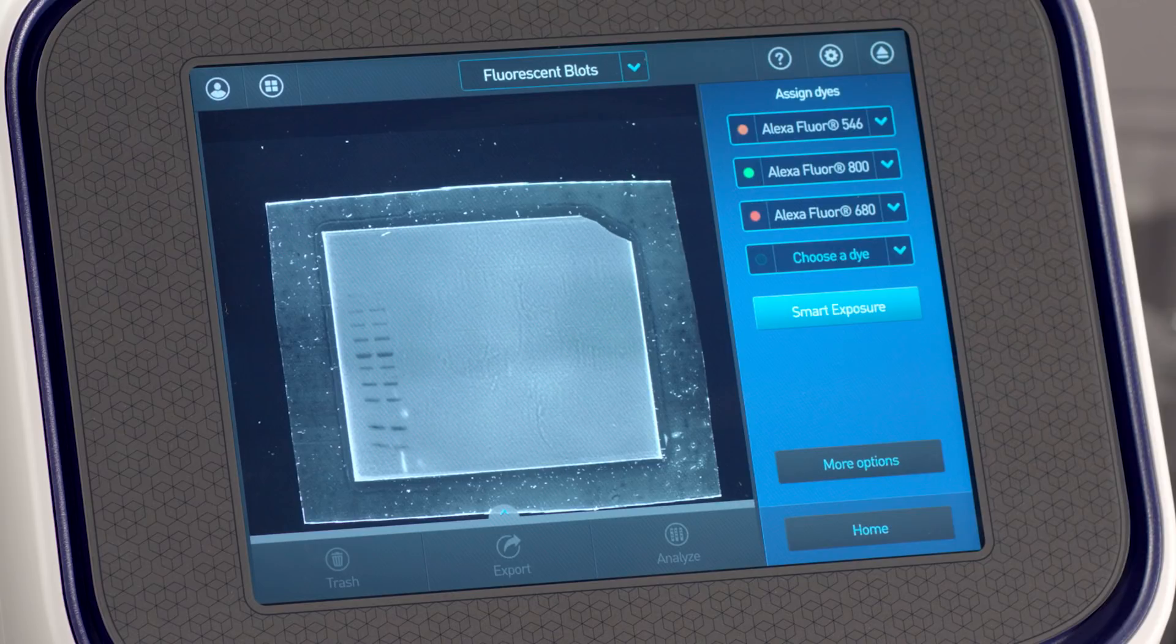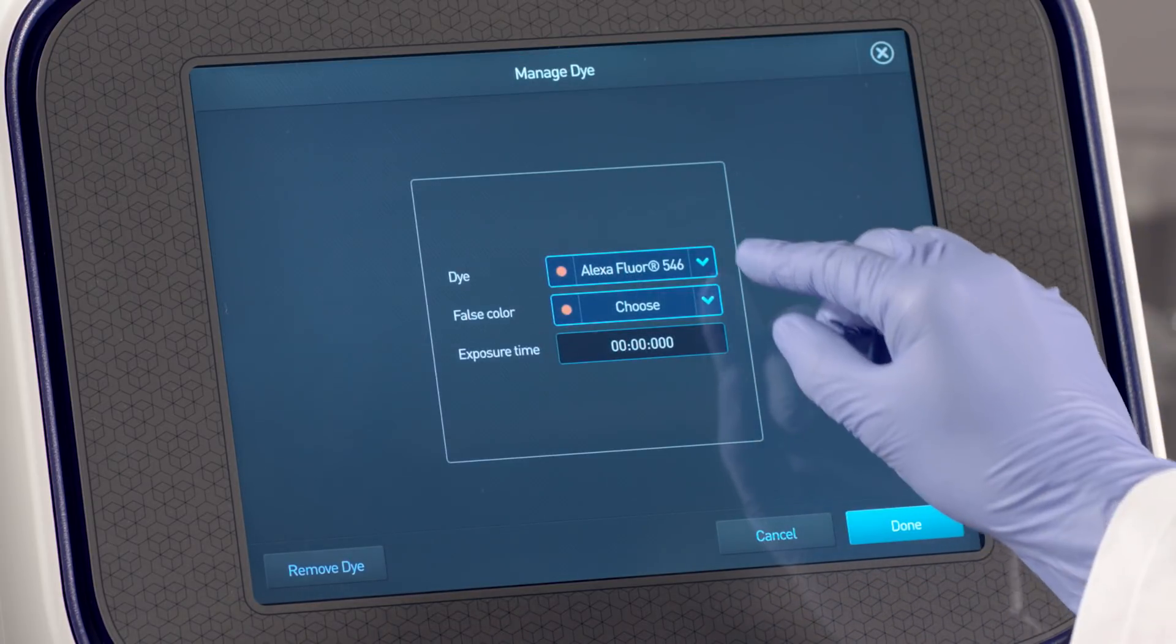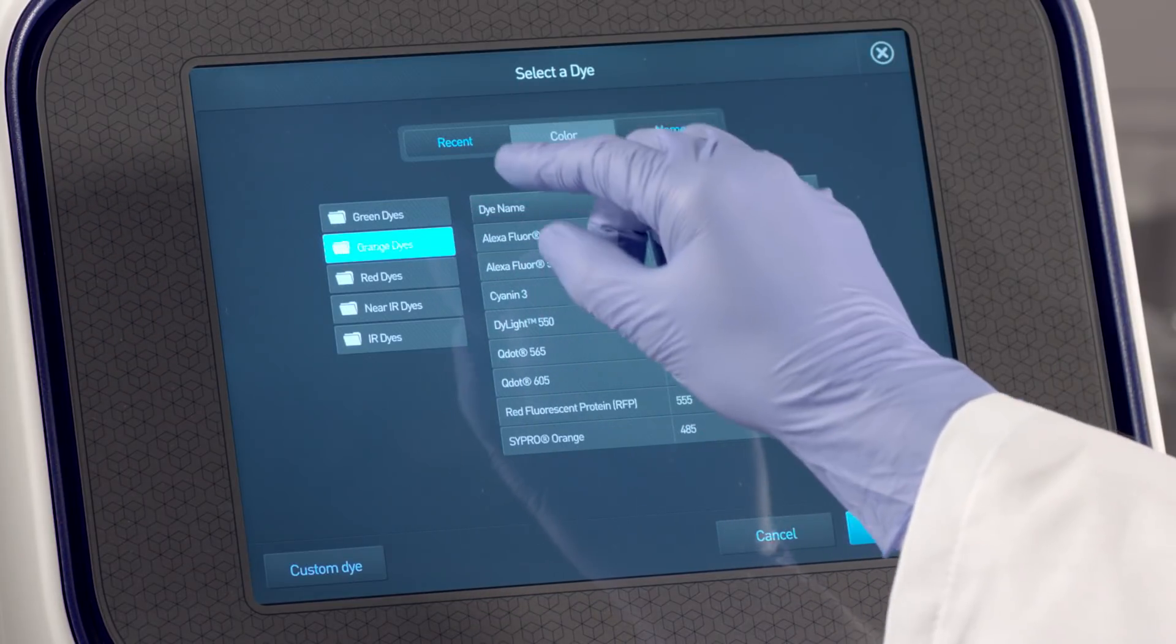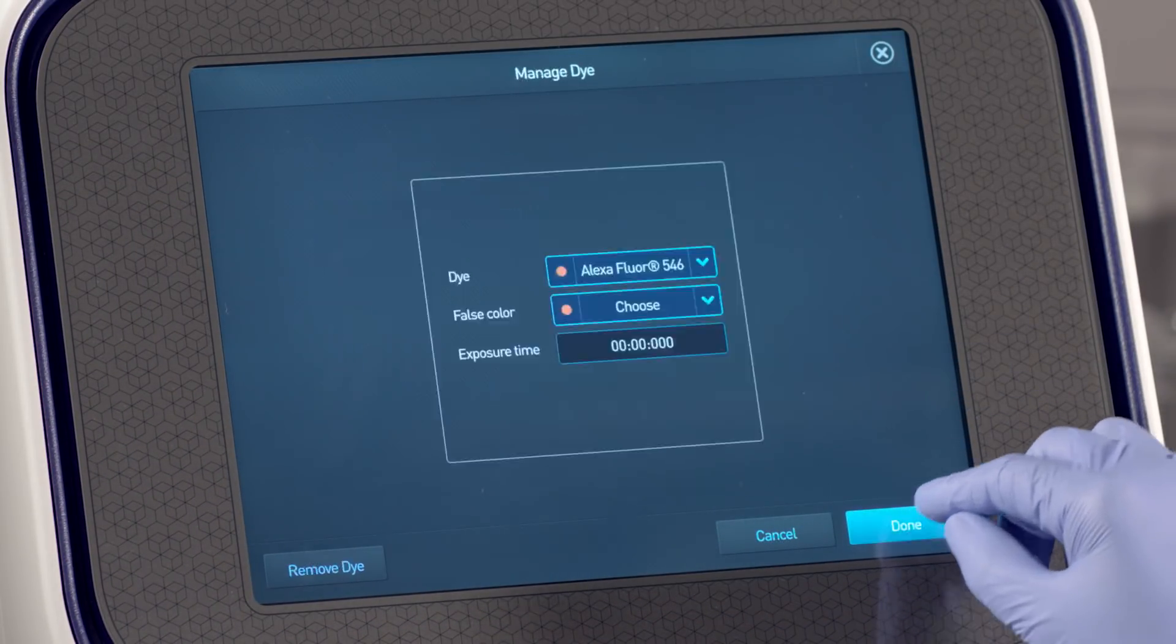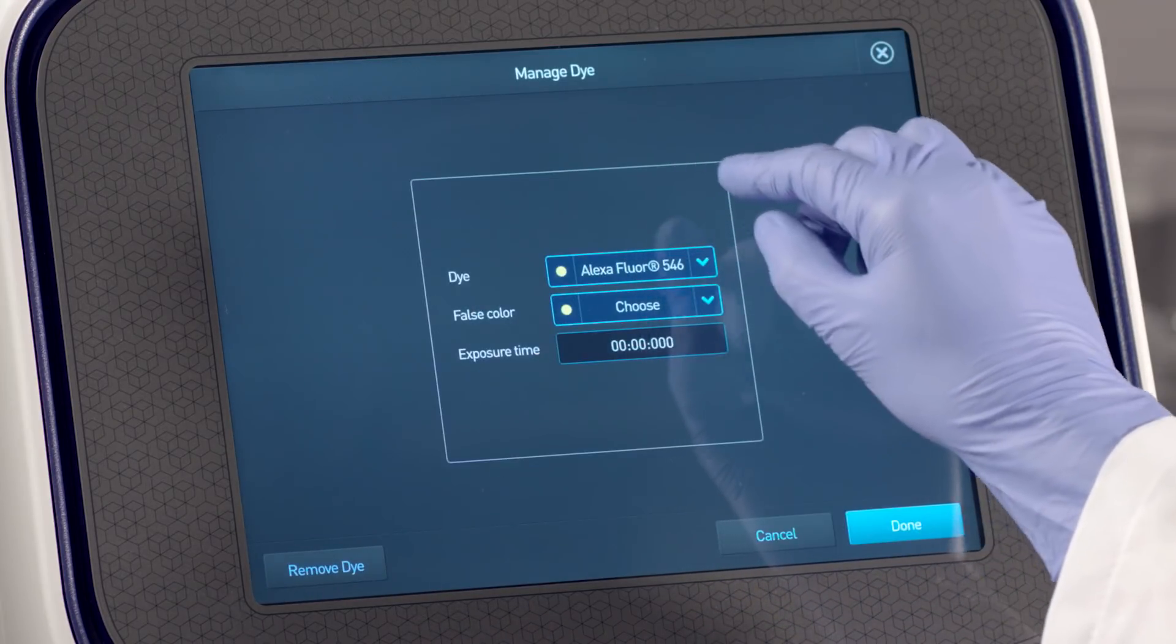To assign a dye, select from a series of preloaded dyes, or you can also create specifications for and assign a custom dye. False color can be assigned to the dye based on visualization preferences.